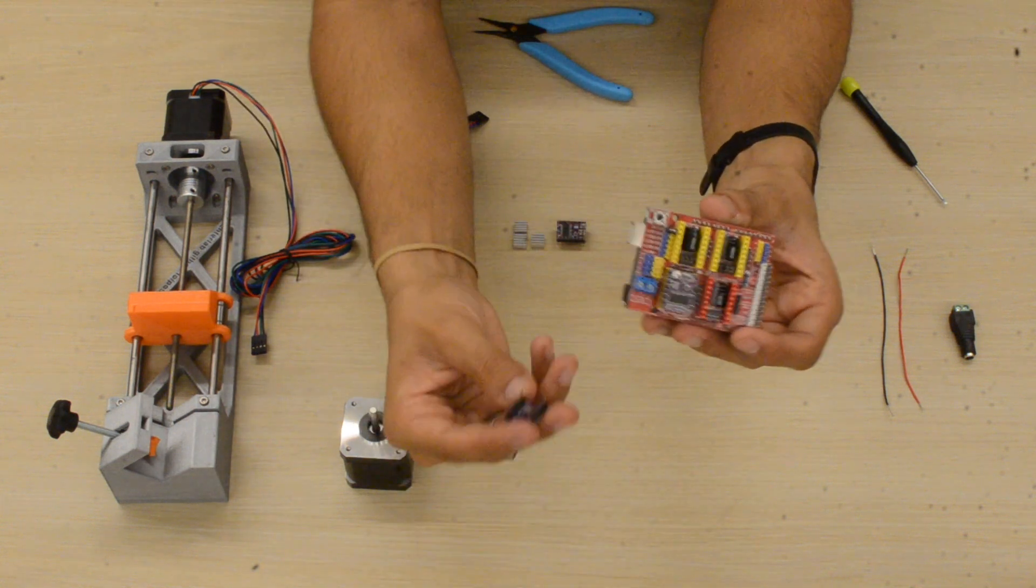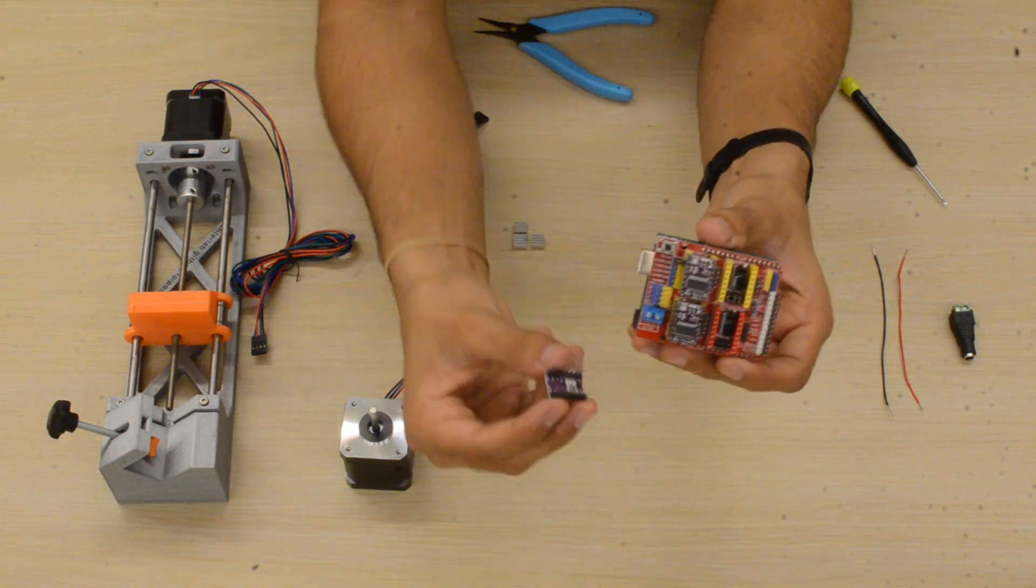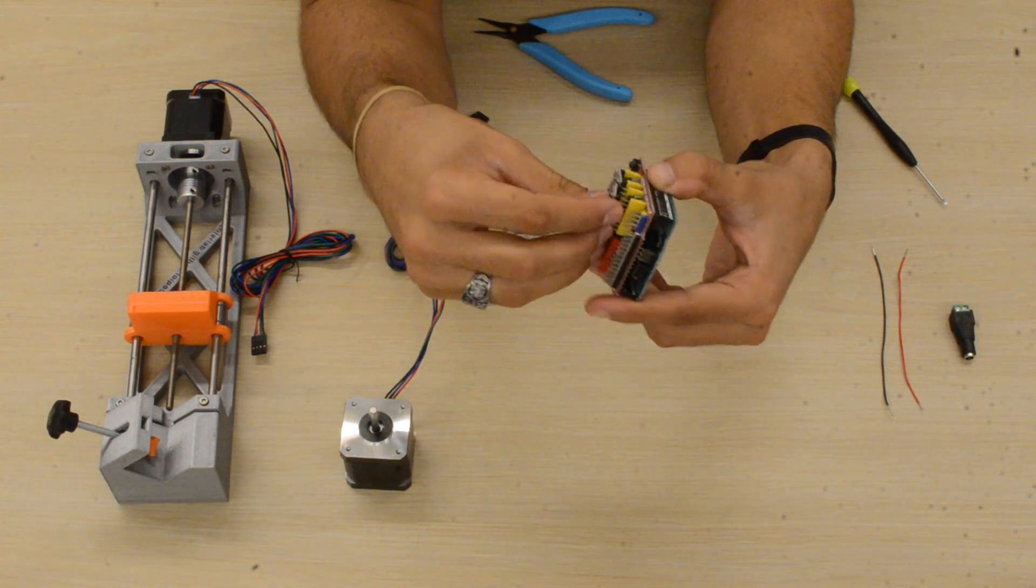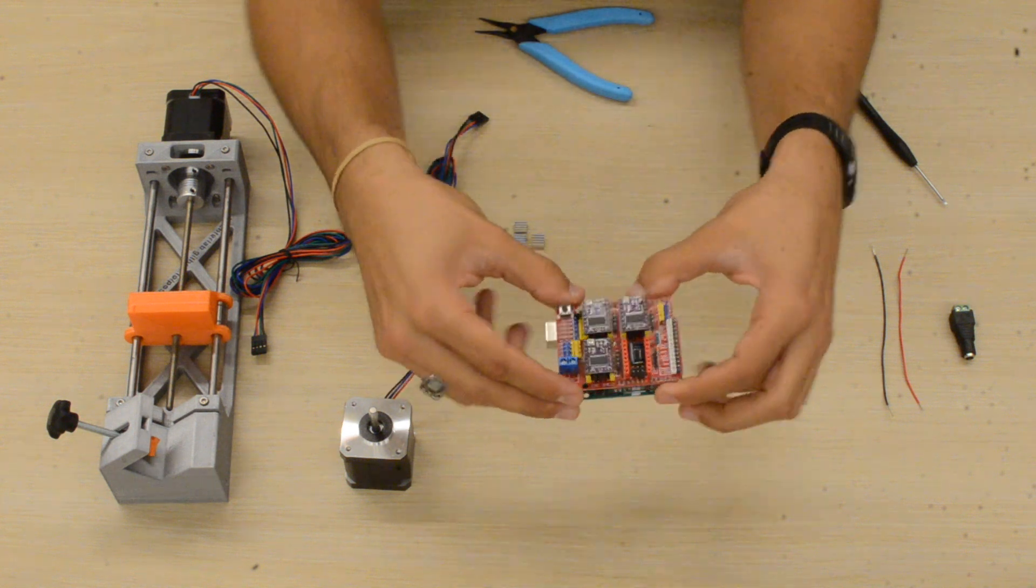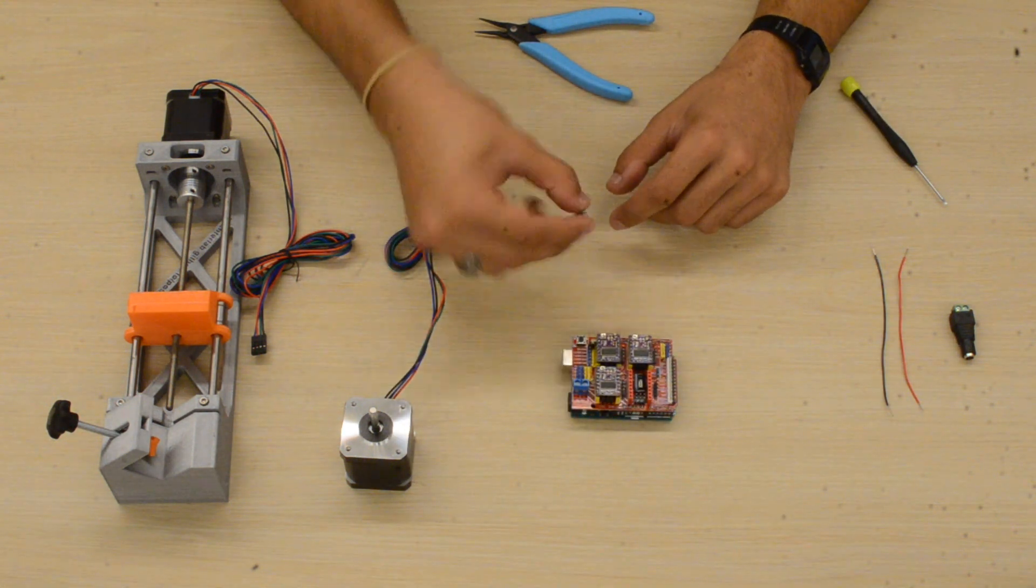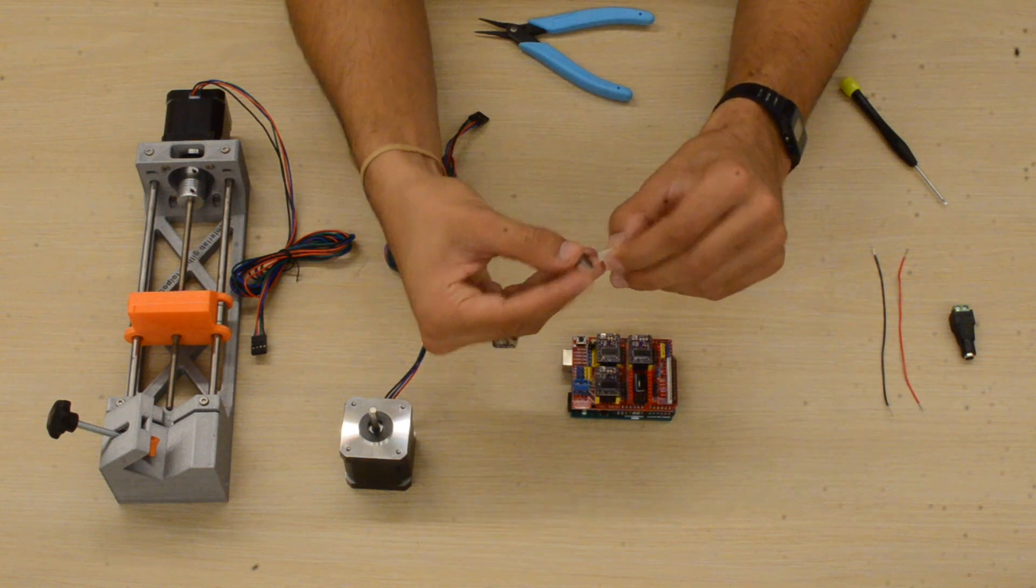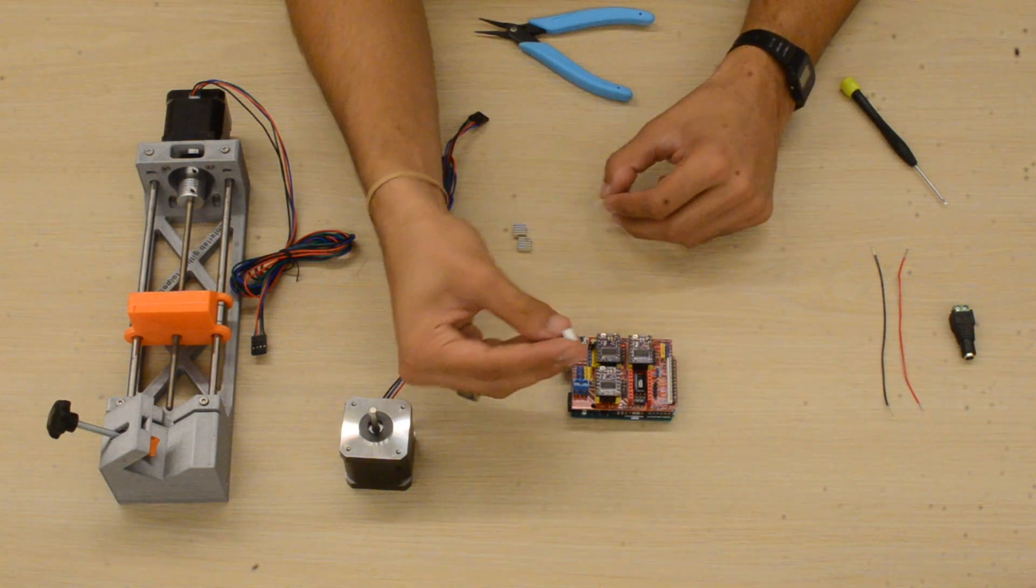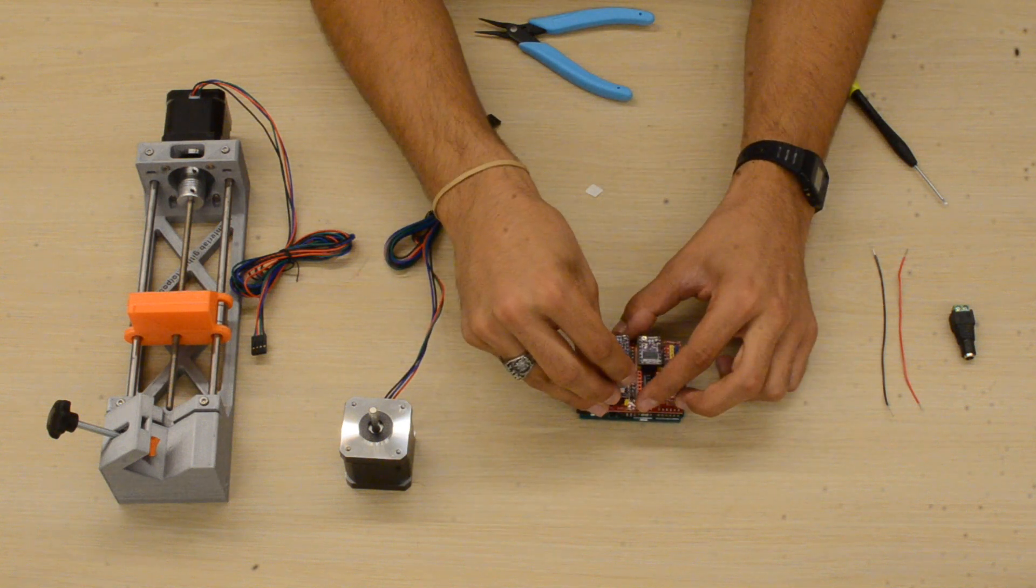We'll do that for all three of them. Once that's done, we'll take these little metal pieces known as heat sinks. Peel off the plastic and place them on the CNC driver. What they do is draw heat away from the chip so when you're running it, it doesn't get super hot.